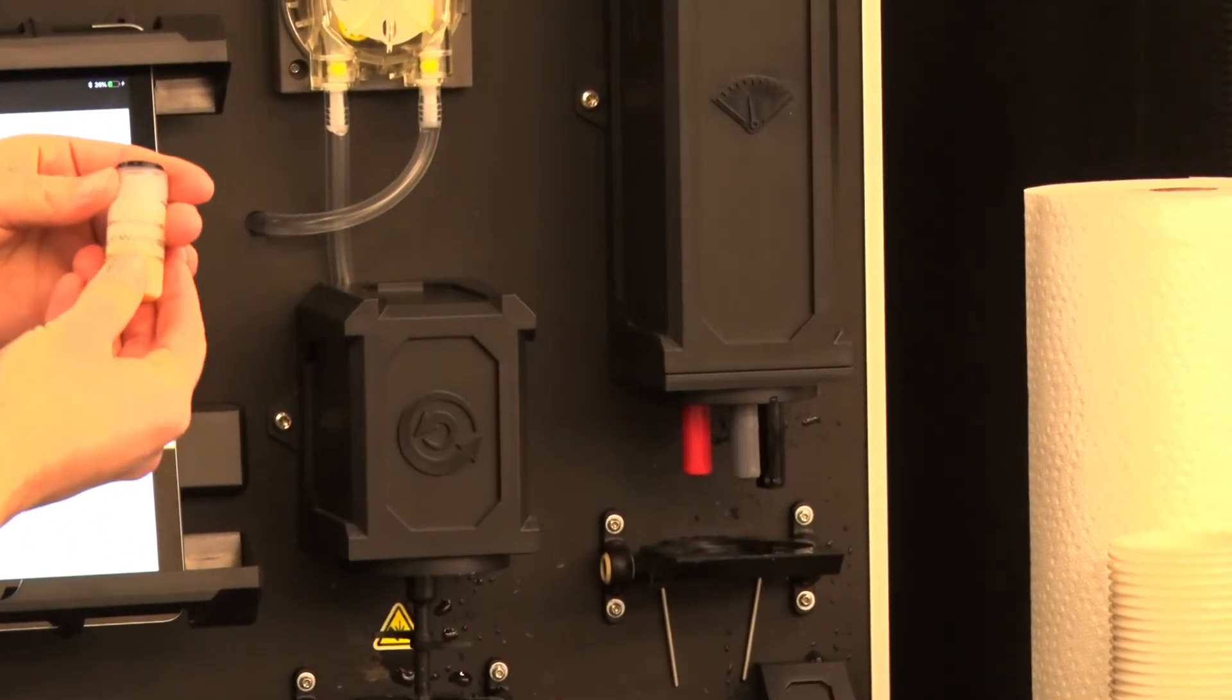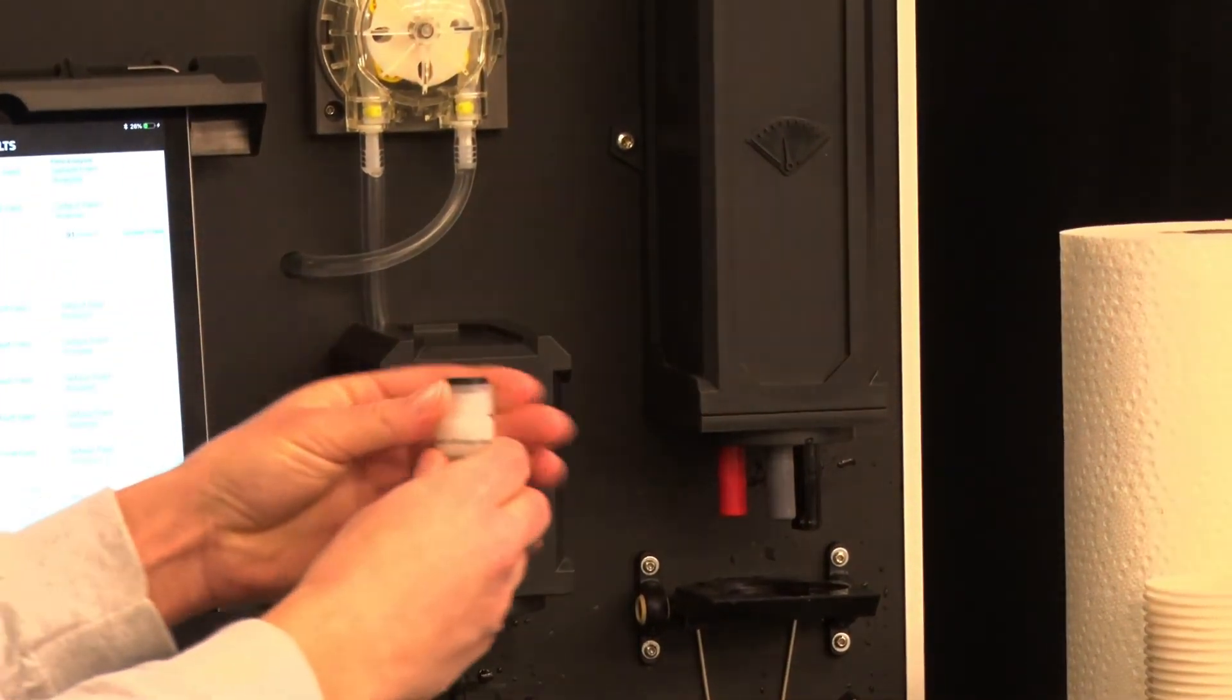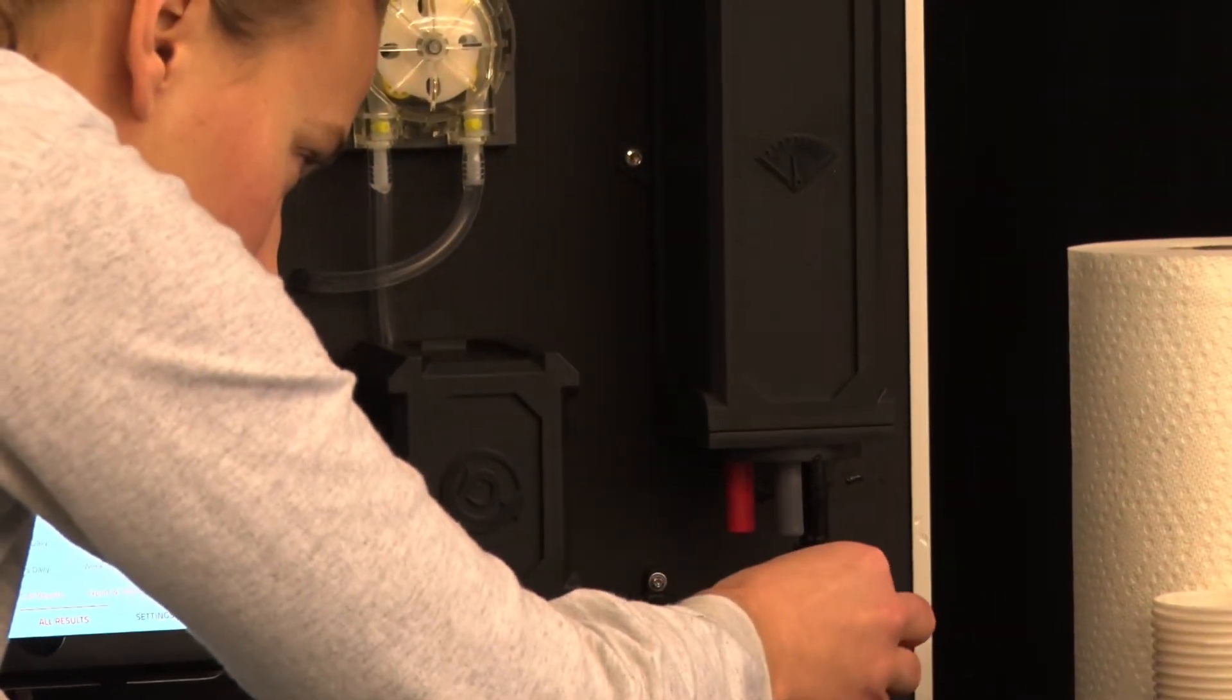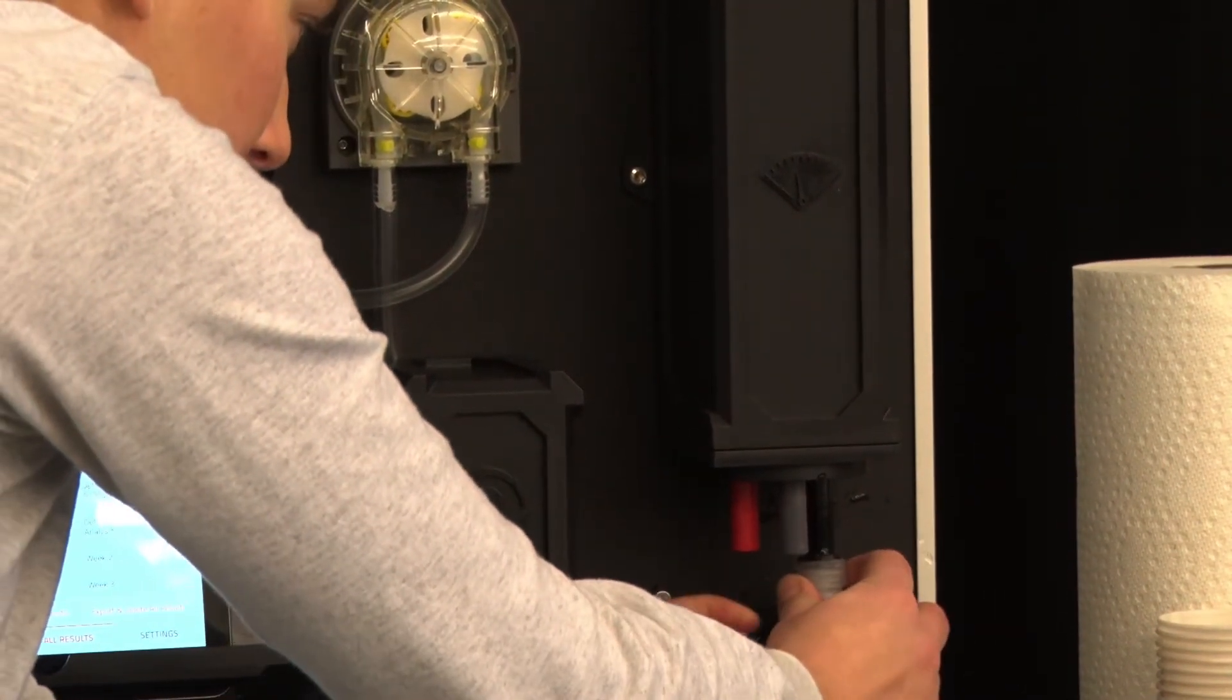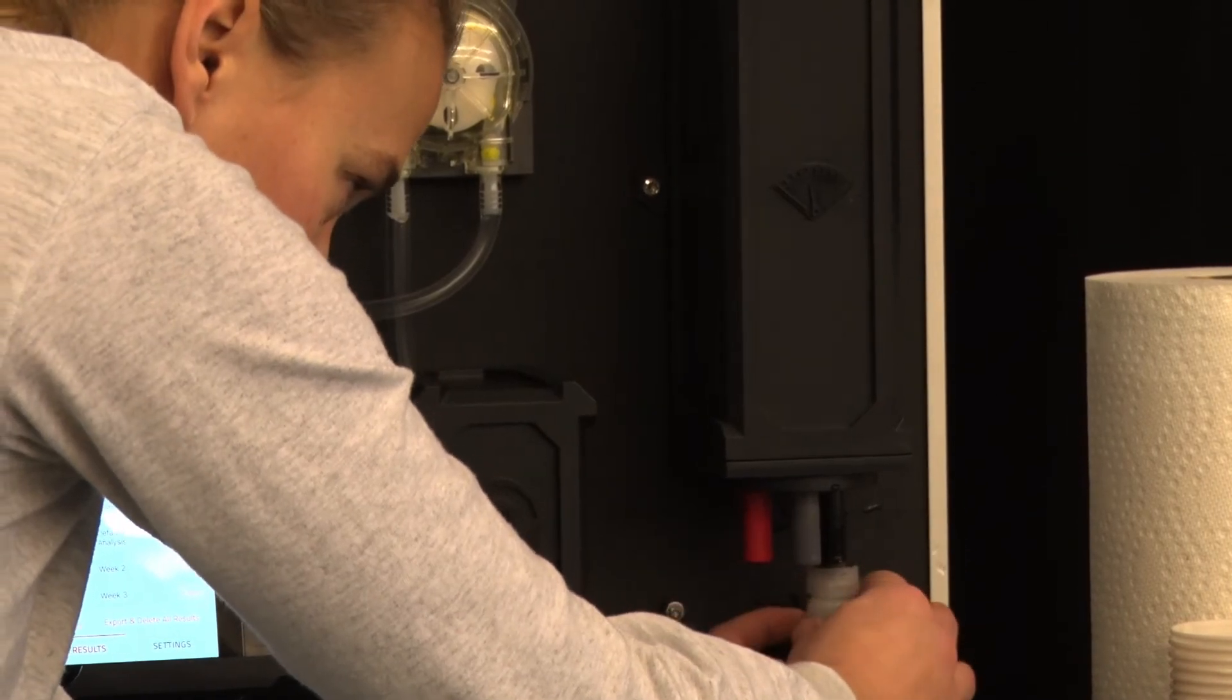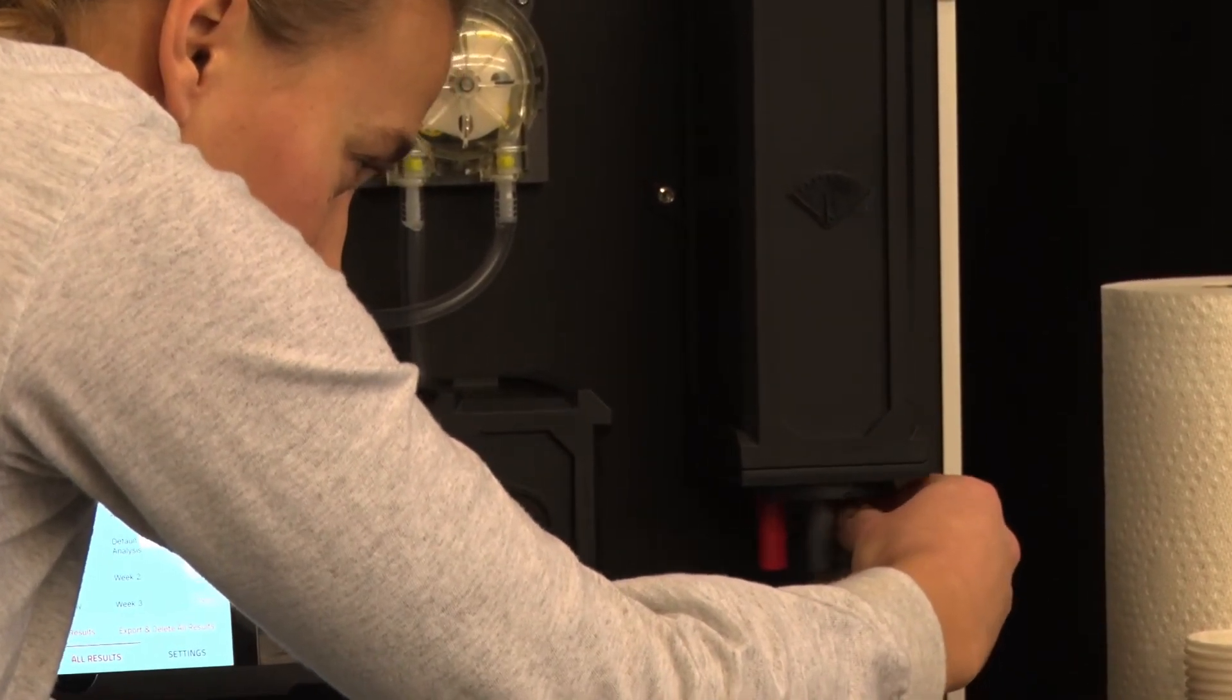To put these bottles on the sensor you want to unscrew the cap a little bit and slide them onto the sensor and tighten the cap.